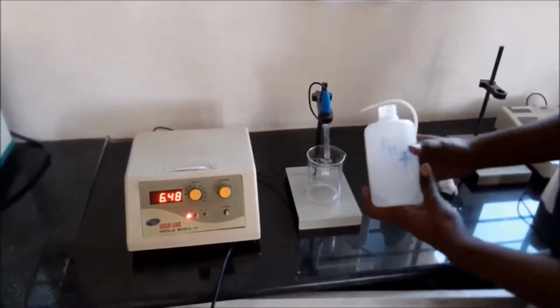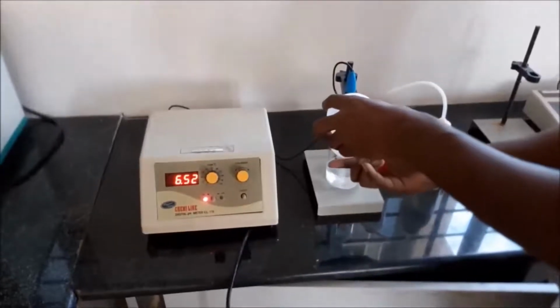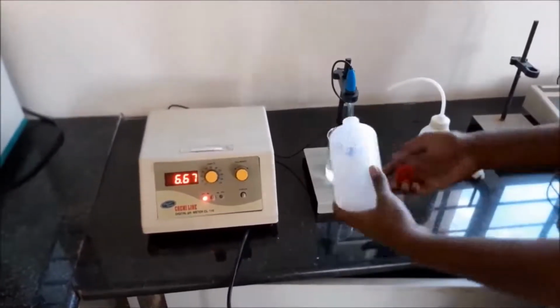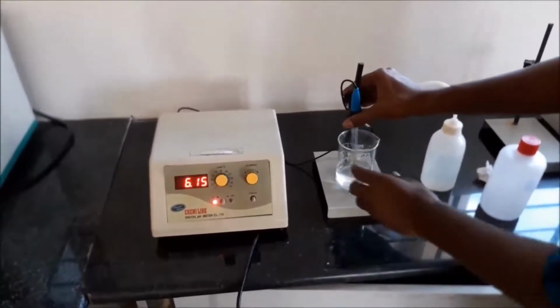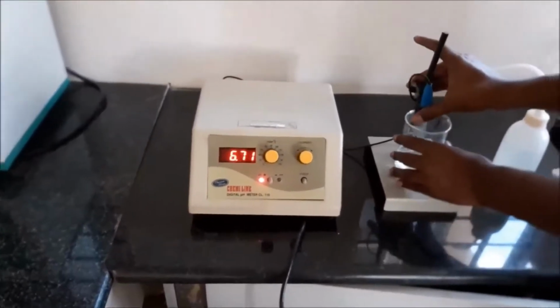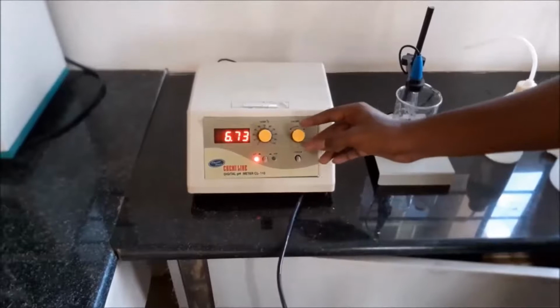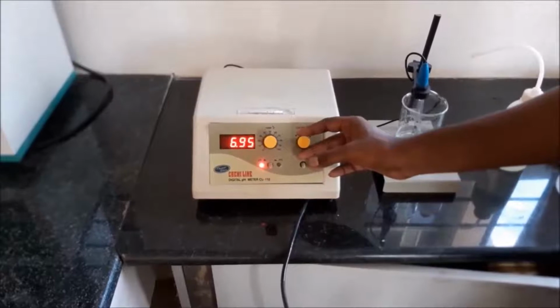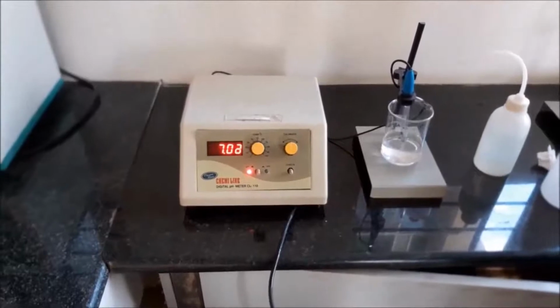Now the buffer solution for calibration of pH value equal to 7 is taken in the beaker. And then the electrode is immersed into the buffer solution to calibrate the pH value equal to 7. The knob is adjusted so that the pH value is almost equal to 7. Now the calibration is complete.